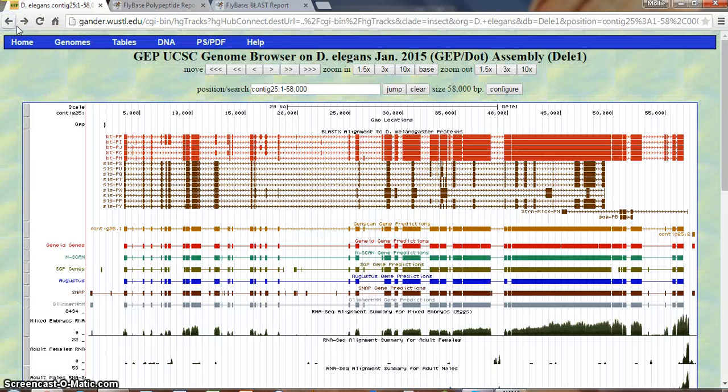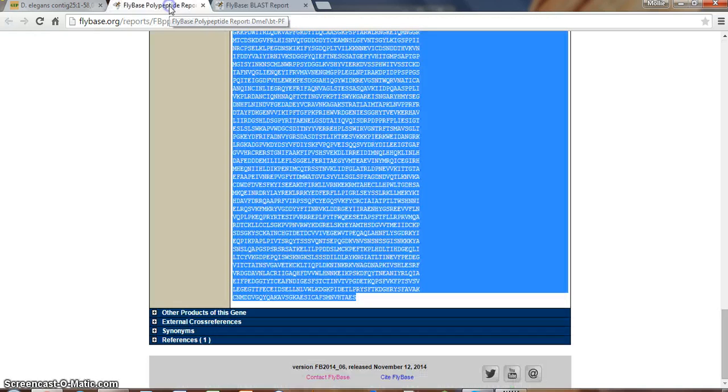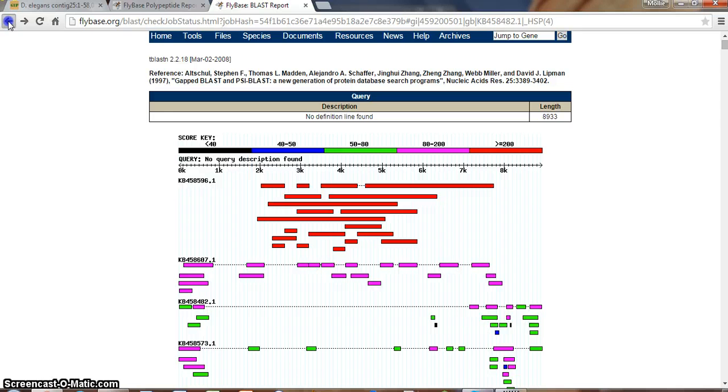I'm going to go back to my genome browser and I want to look at this. And maybe actually before I do that, I would like to know where my Contig sits in the elegans genome. So I can compare and say, okay, we have all of these coordinates. Do any of them actually fall within where the Contig ends up? And so here's where we're going to blast the beginning and the end of the Contig. And so we're gonna, whoops, not here. I'm gonna go back a little ways.